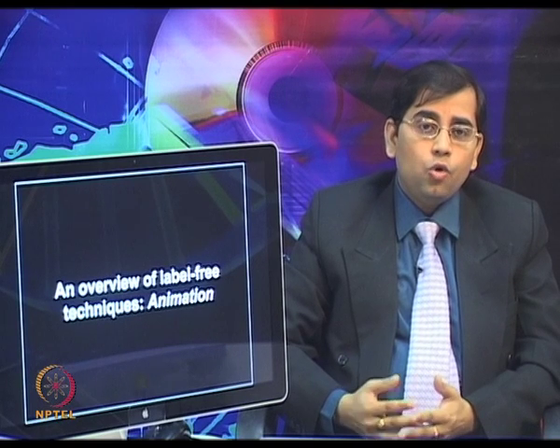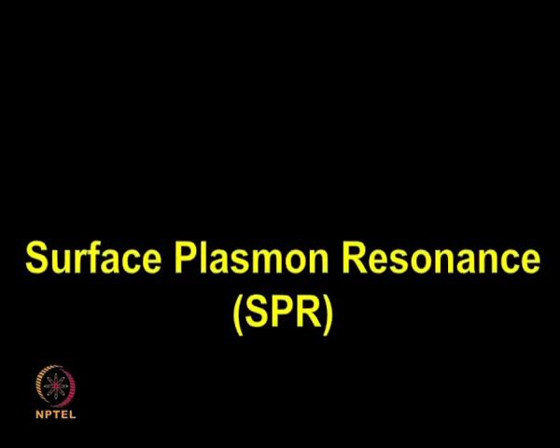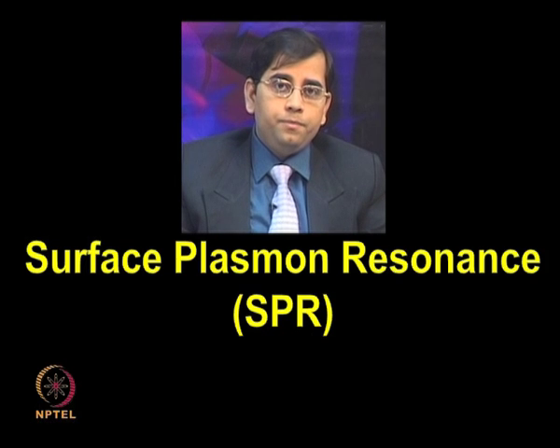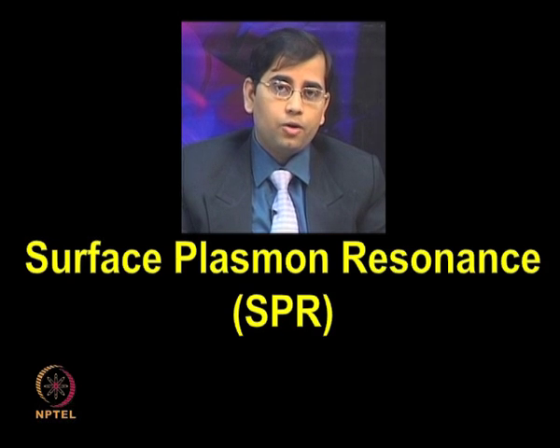I hope by looking at the overview of label free techniques in the animation, you got a glimpse of the various types of methods currently available in label-free detection. So, now let us talk about one of the very promising label-free techniques, surface plasmon resonance or SPR.